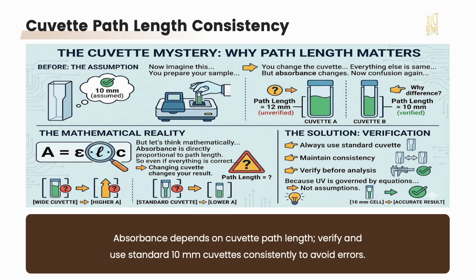Now, this is where many analysts make a mistake. They assume all cuvettes are the same, but even slight variation or using a different type can shift your values. Now, ask honestly, before using a cuvette, do you verify it or assume it? So, what should you do?